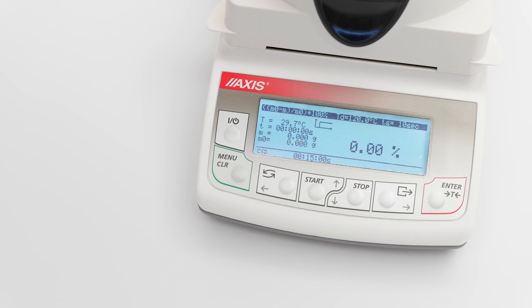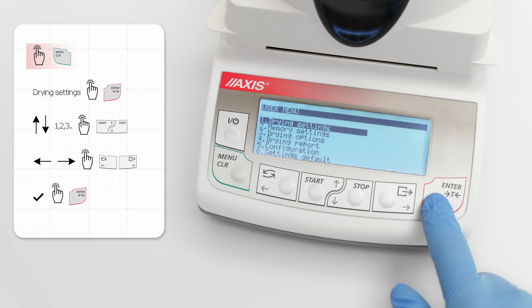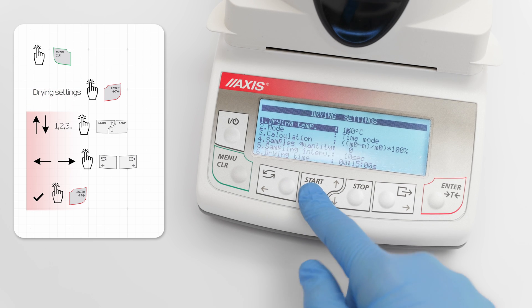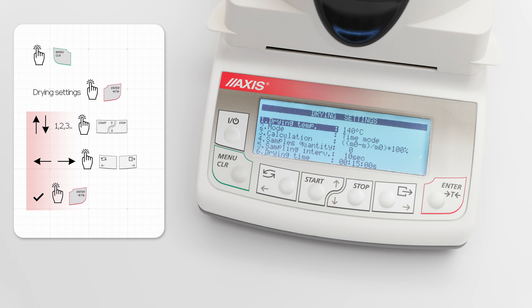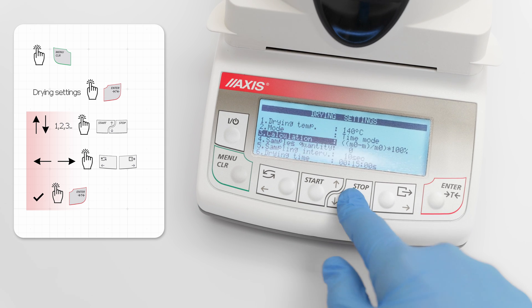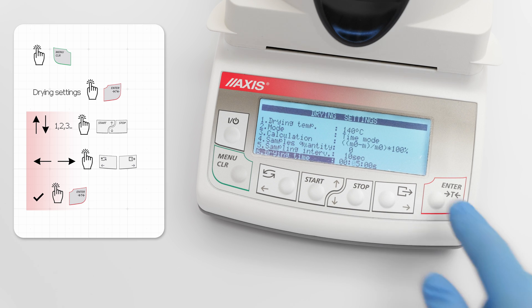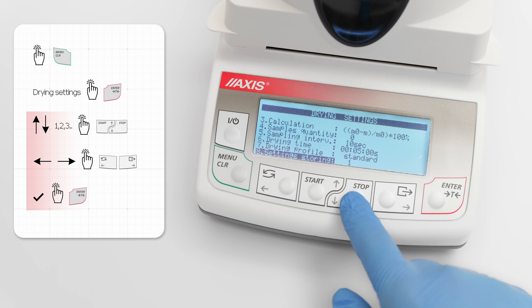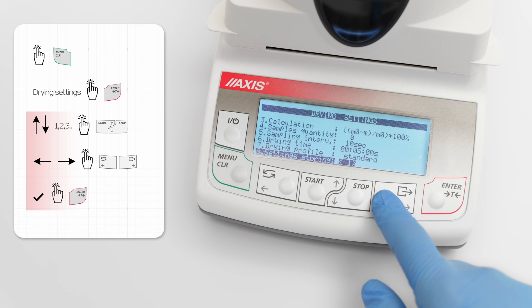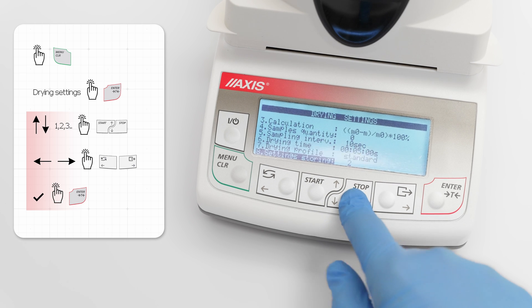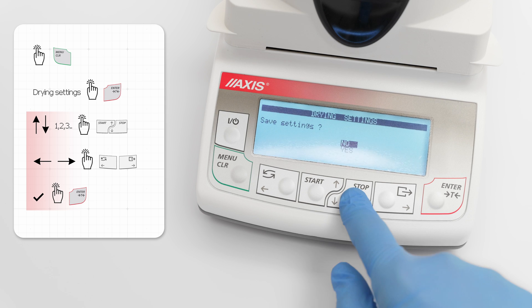Set drying temperature to 140 degrees and drying time to 5 minutes. To do this, press the menu key and select drying settings. You can use arrow keys to navigate through the menu and edit the settings with the enter key. To set parameters, use the arrows and confirm using the enter key. Settings storing shows the number in the device memory where the settings will be saved. The number can be changed. After making all changes, select exit and confirm settings by choosing yes.